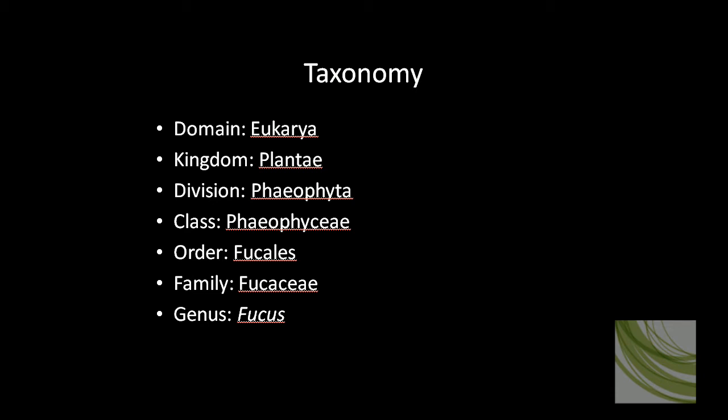Here is the taxonomy of Fucus. It's in the domain Eukarya, which means a true membrane-bound nucleus, genus Fucus. This is a slide of the female concepticle of Fucus, the brown algae.